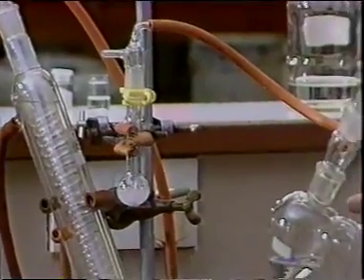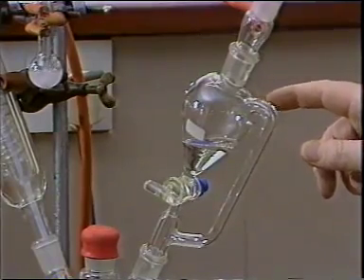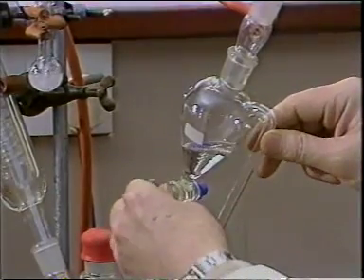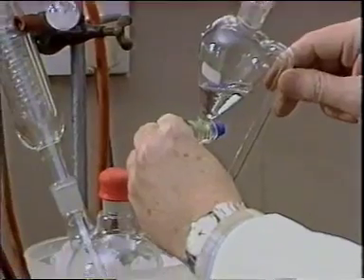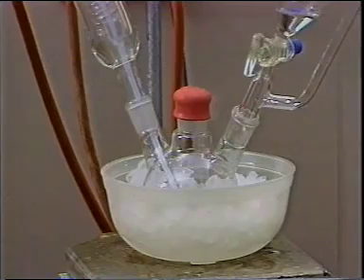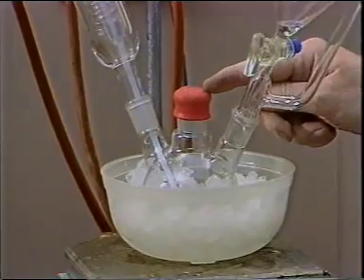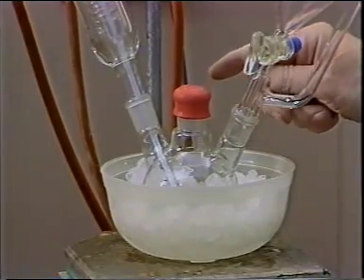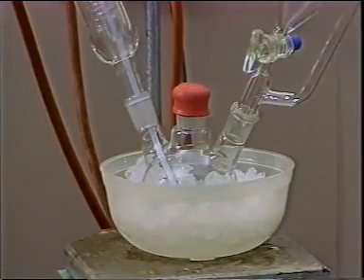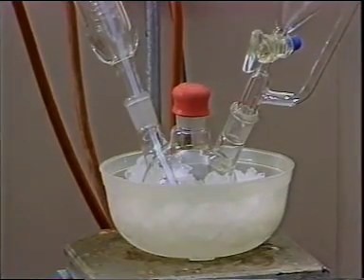We also here have a pressure equalizing funnel, which allows us to add a reagent without exposing the interior of the apparatus to the air. I've replaced the stopper in the diagram with a rubber septum, which allows me to introduce a further reagent using a steel needle. When the needle is withdrawn, the septum seals itself again.